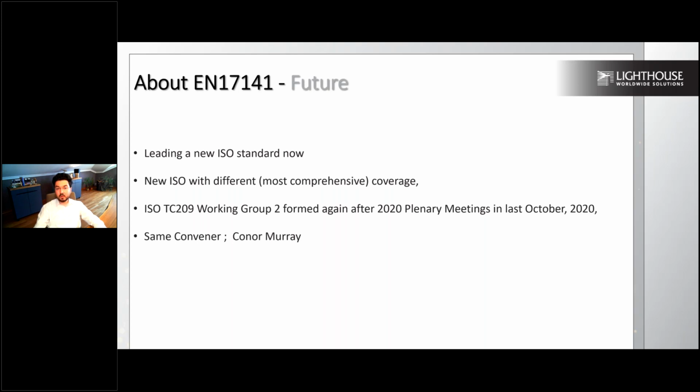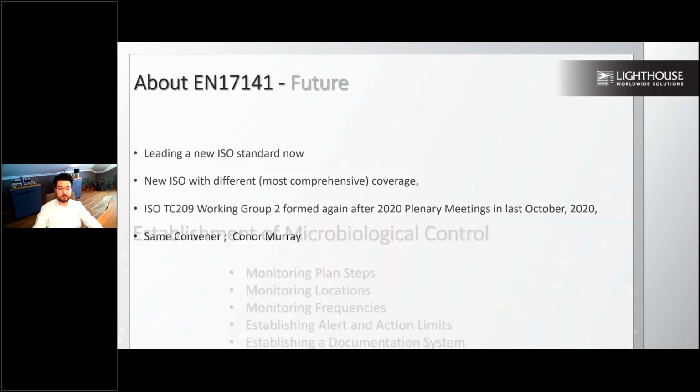If this is an EN norm, it is only valid for the European countries. However, most international organizations are adopting and implementing it. If you are importing your goods to or exporting them from the European countries, then these norms should still be valid for you.